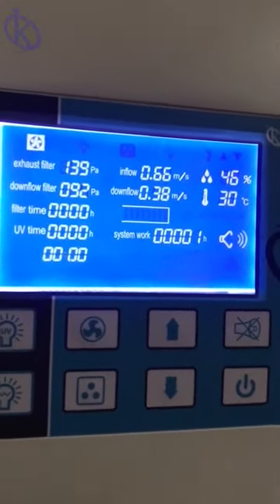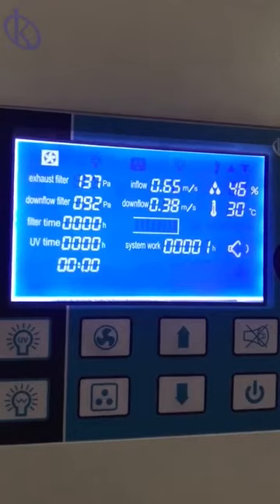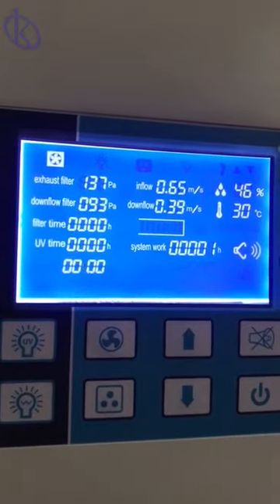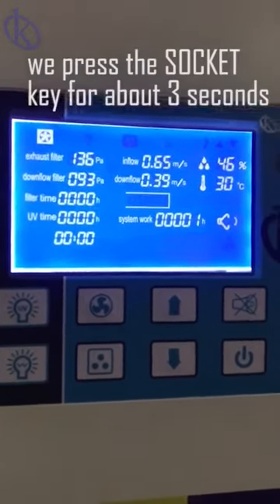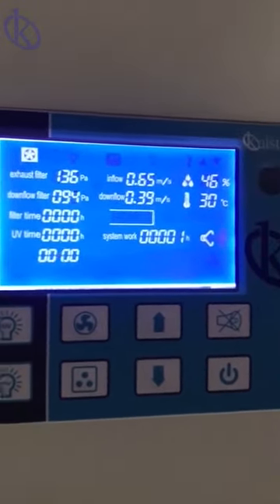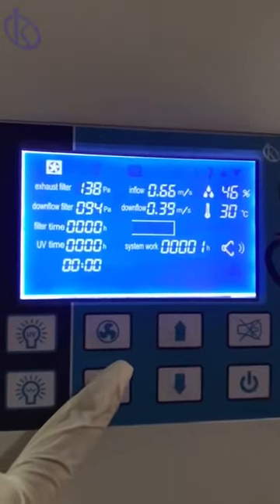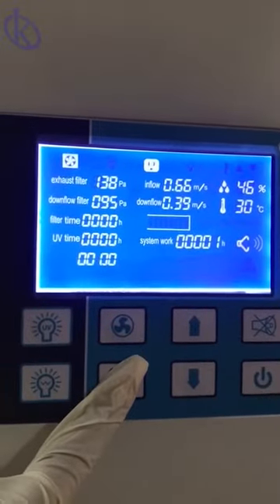Once the hood is turned on and the values have stabilized, we press the socket key for about 3 seconds, and then we will see two values appear at the bottom of the screen.